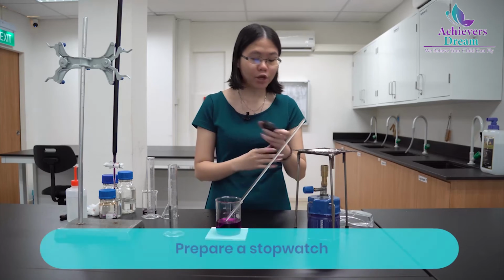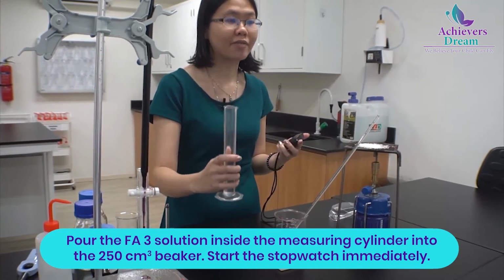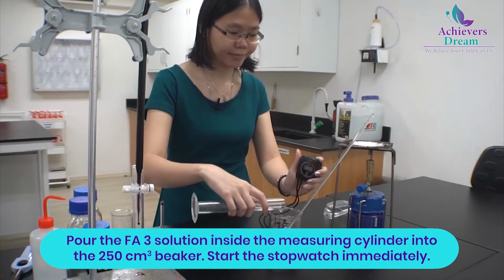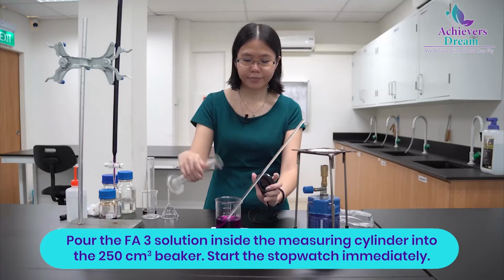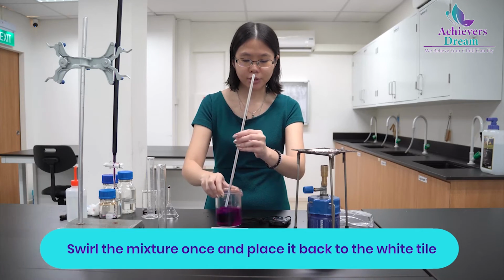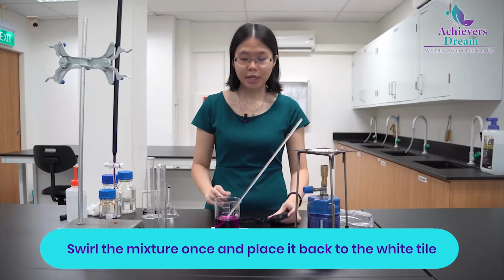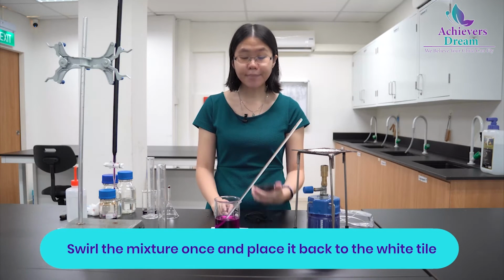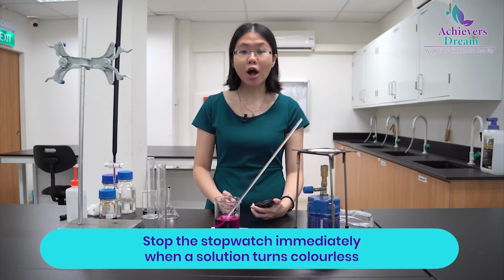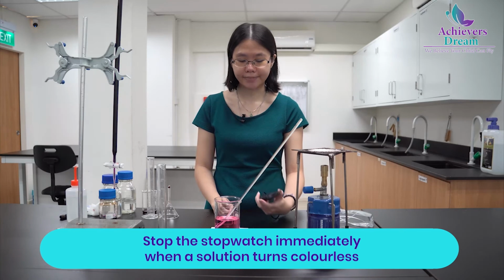Then prepare your stopwatch. Once you add the 25 cm3 of Fa3 solution, your glucose solution, you immediately start your timing. Then swirl the content of the solution once and stop. So you take note of the time that it takes for the solution to turn colorless. Record the time and the temperature as soon as the solution is colorless.